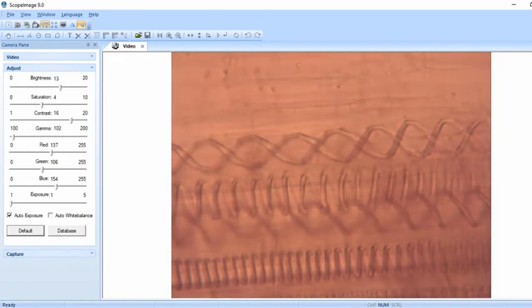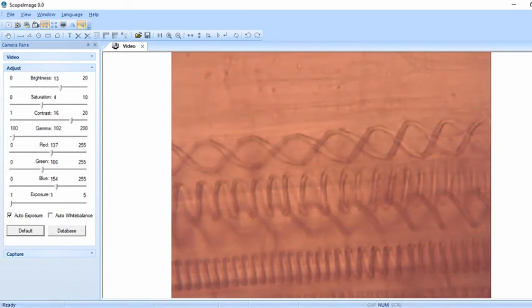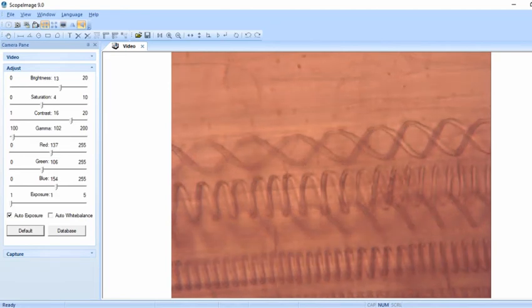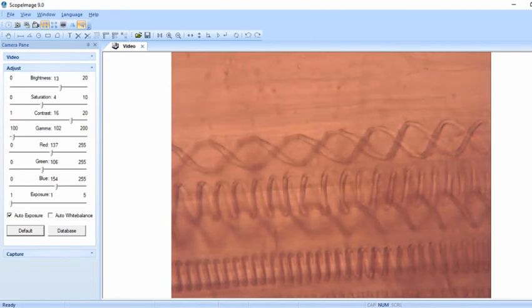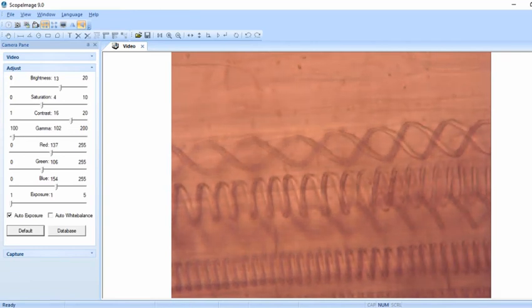I can see them pretty well through the actual optics on the microscope, but again, the camera isn't the best. But by changing the focus a little bit, you can kind of see the three-dimensional aspect of it. Sorry, it's 6 in the morning, and I've been doing this for hours. But yeah, that's kind of cool.